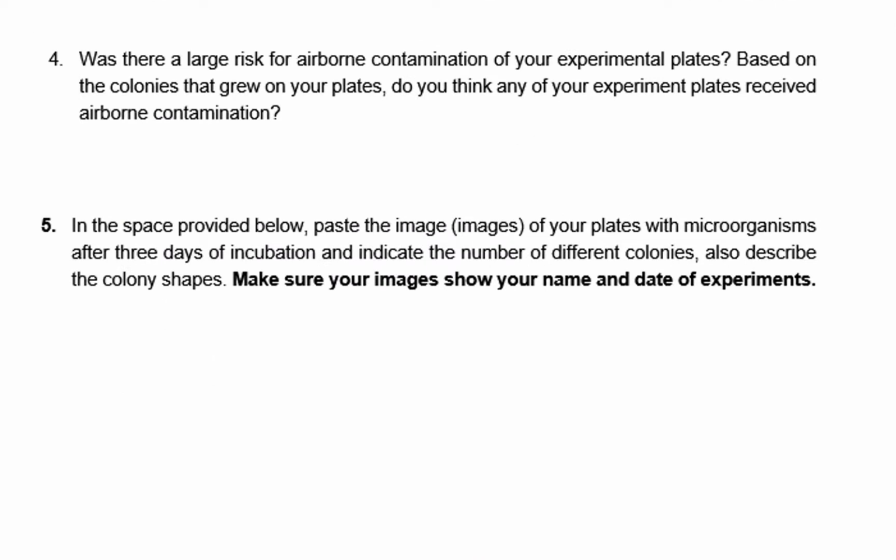As you can see under number 5 in this lab worksheet, you need to attach the images of your plates with microorganisms after 3 days of incubation and indicate the number of different colonies and also describe the colony shapes. Important in here, you have to make sure that your images show your name and date of experiment. Besides, all plates in here have to be labeled accordingly to the experiment requirement.